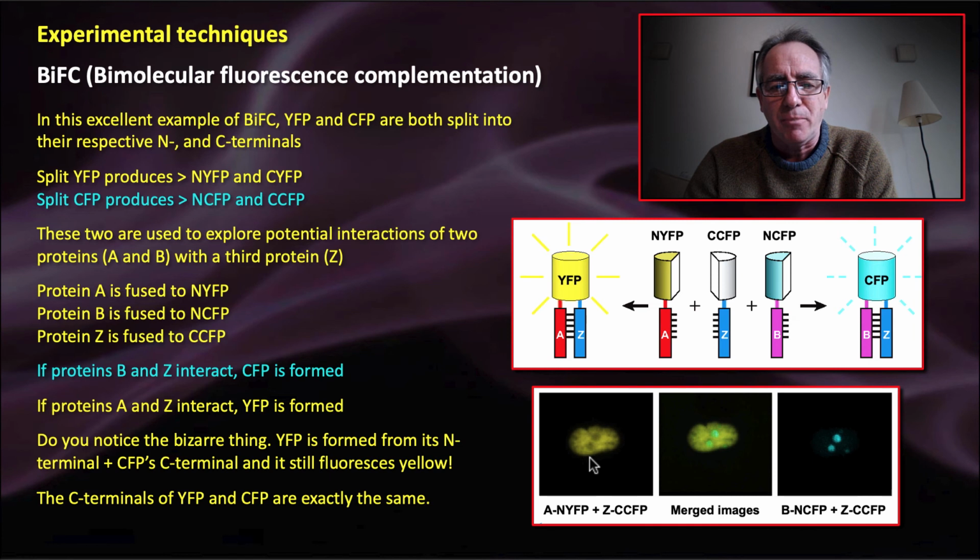They showed a couple of different pairs of protein interactions, and they've shown that when the protein Z interacts with A, localization is within the nucleoplasm. When the protein Z interacts with protein B, localization is within the nucleolus.